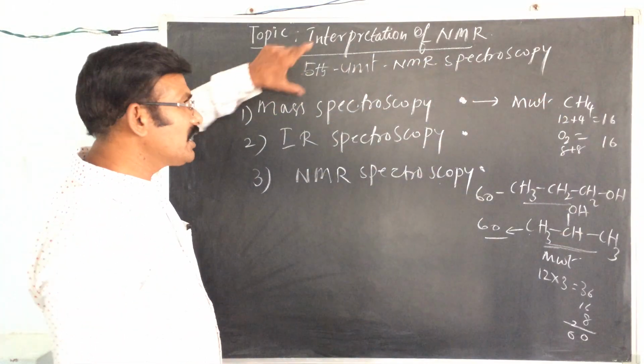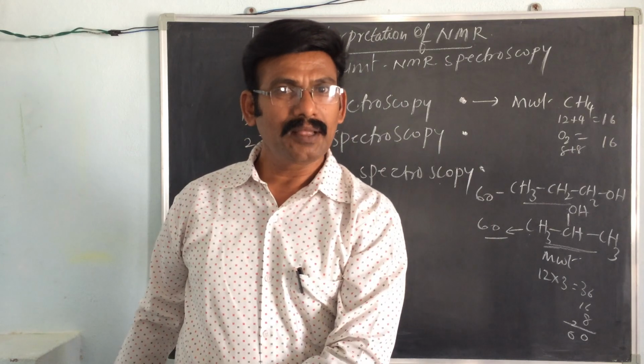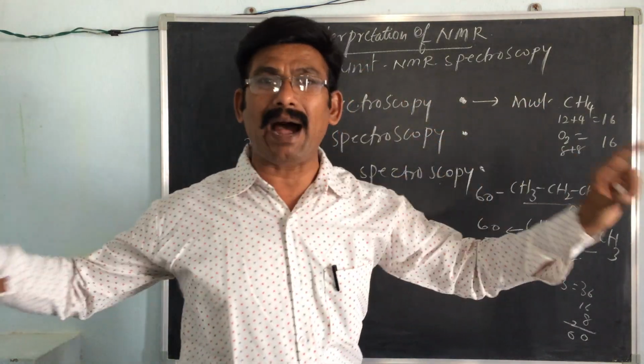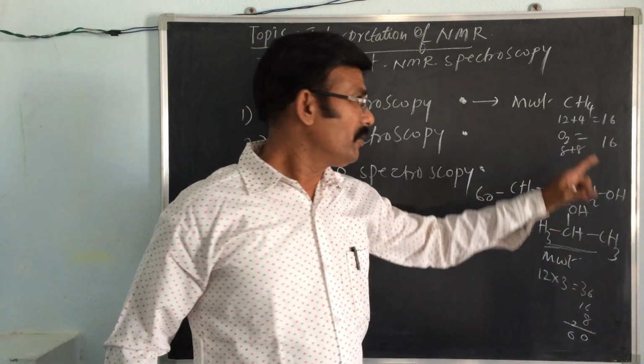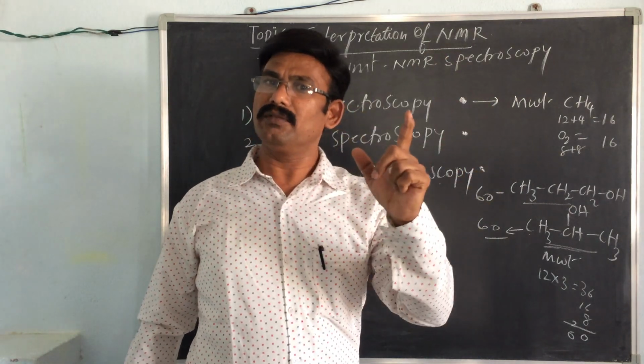This spectrum gives only an idea about the molecular weight. It gives only molecular weight but not structure. Okay. So molecular weight we have to know. That's okay.